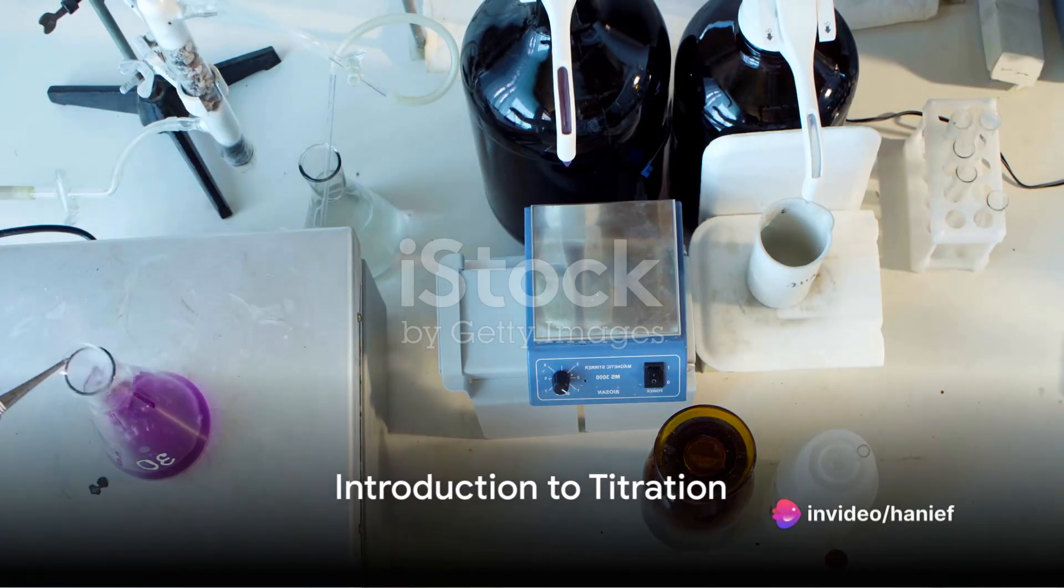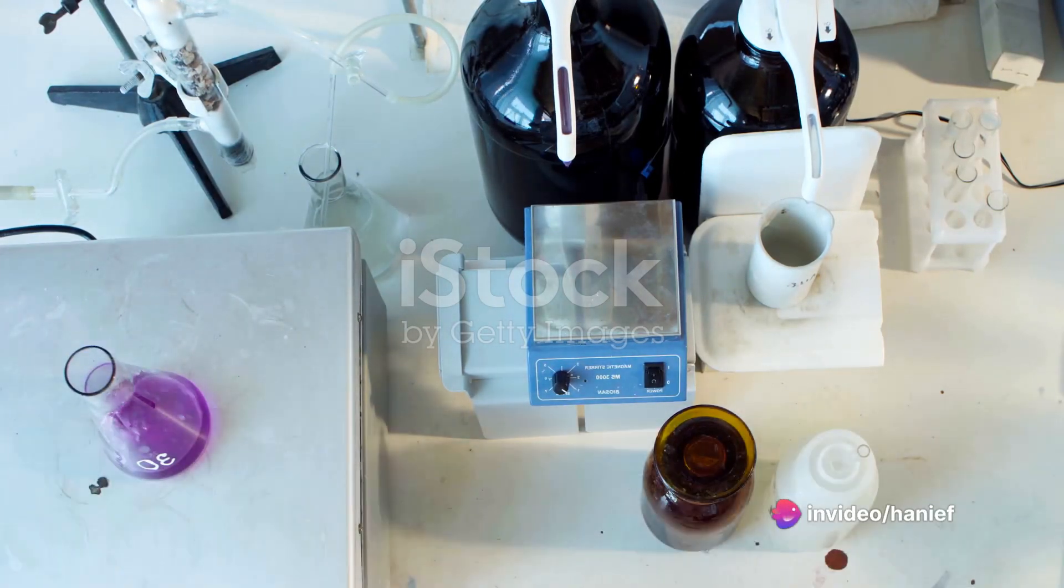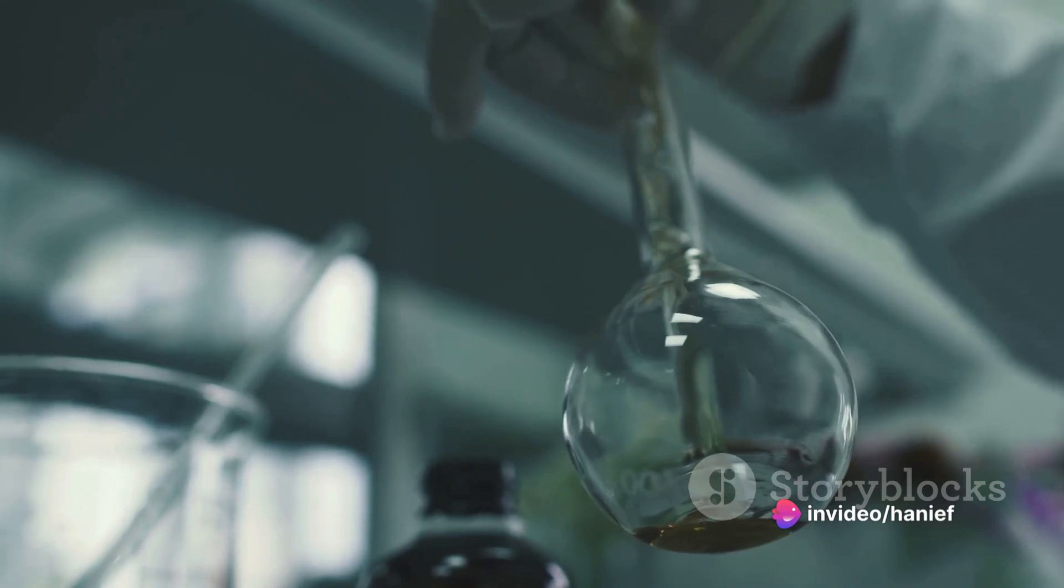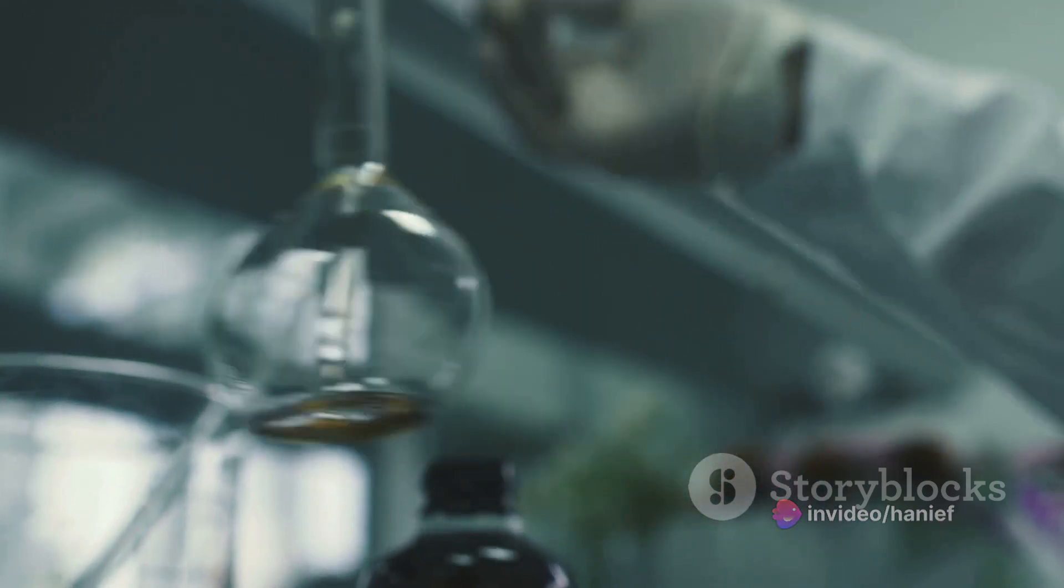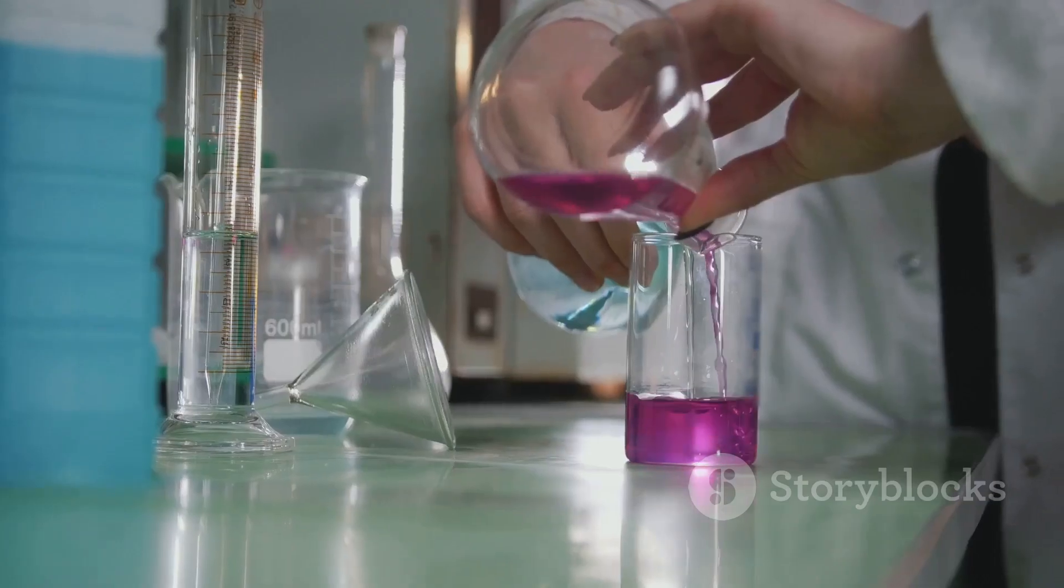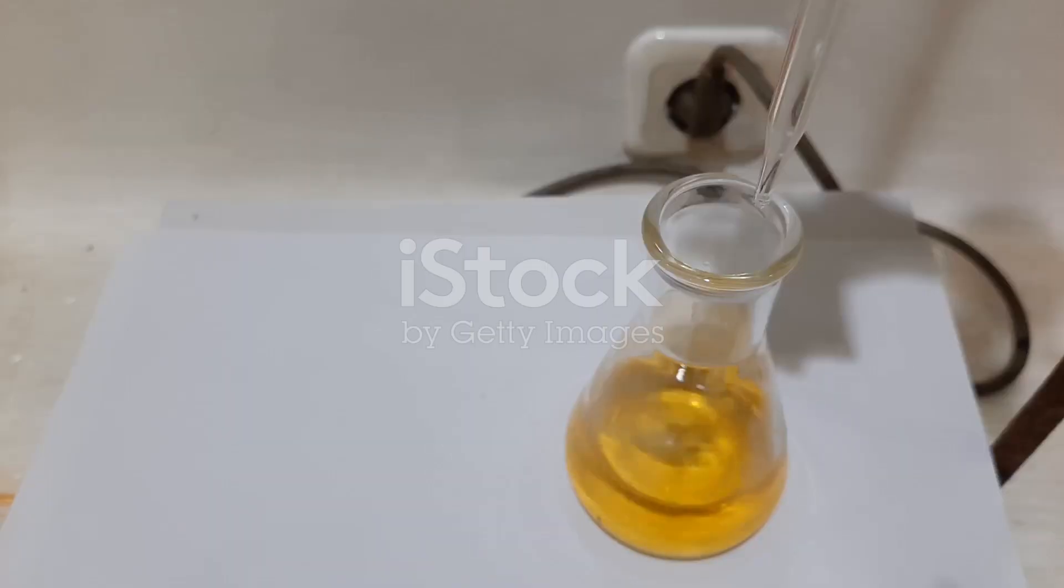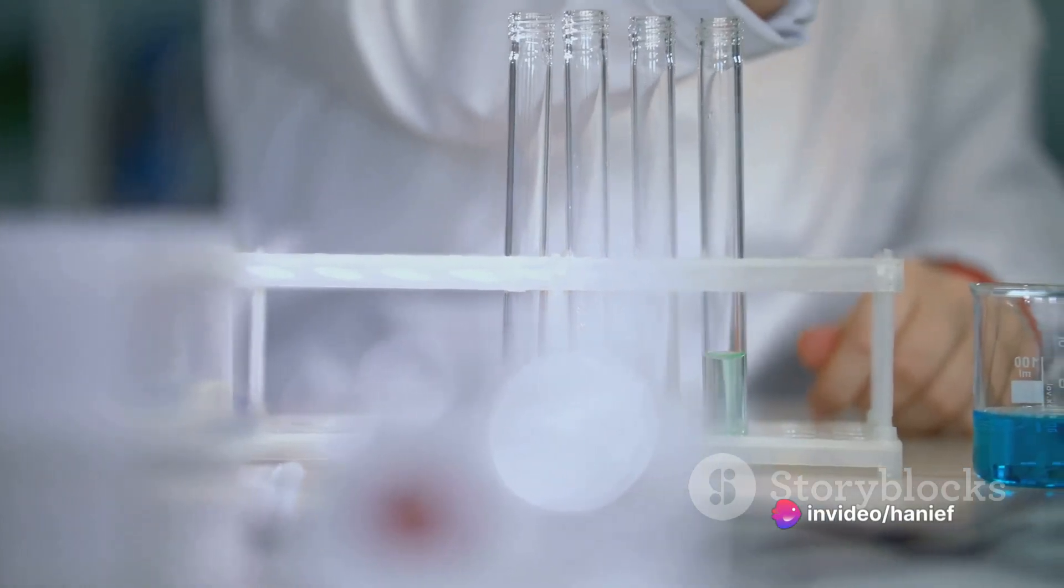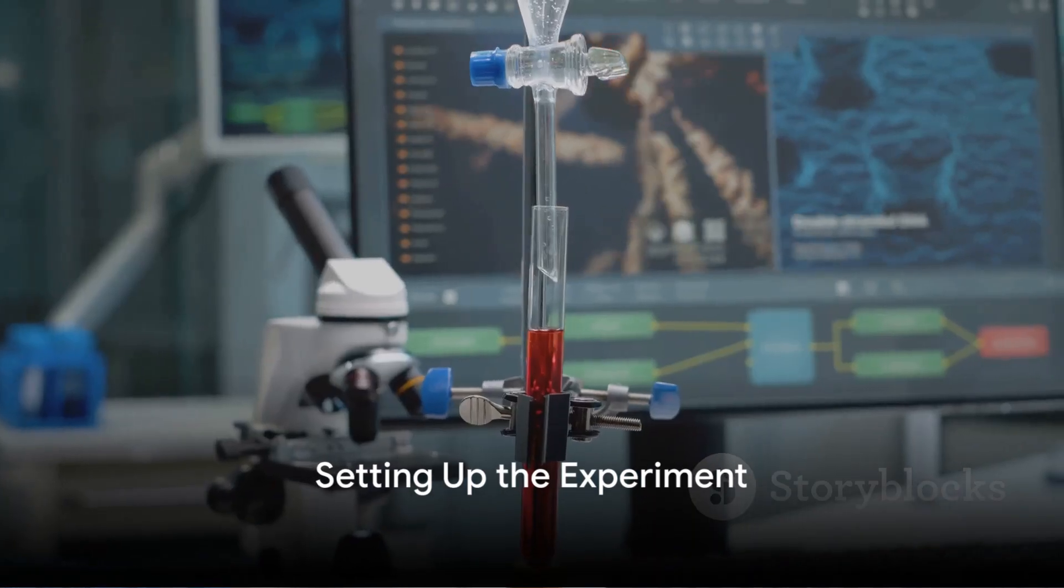In the world of chemistry, titration holds significant importance. It's a versatile technique used to determine the concentration of an unknown solution. One of the most common and interesting titrations is the acid-base titration between hydrochloric acid (HCl) and sodium hydroxide (NaOH). Today we delve into the fascinating process of this titration.